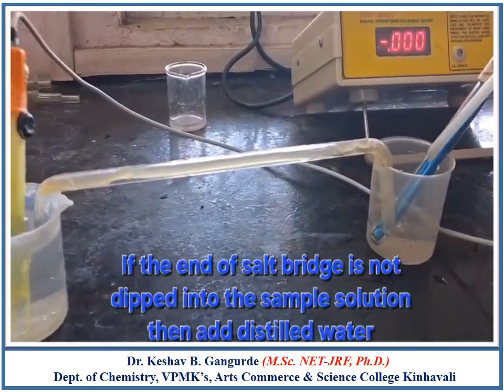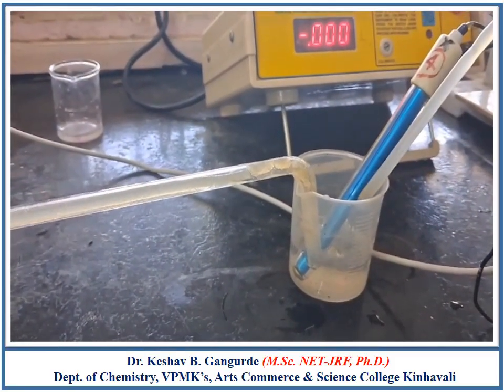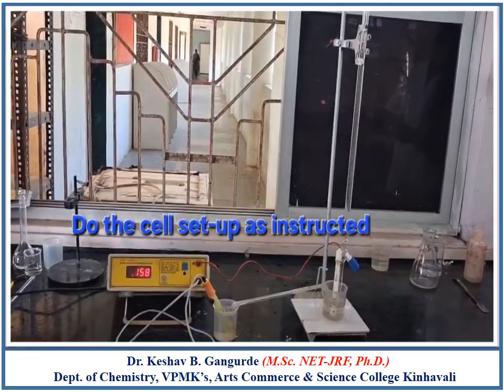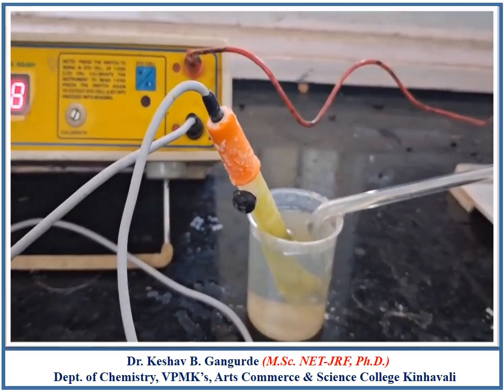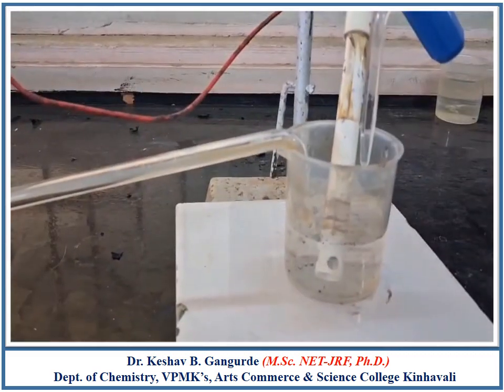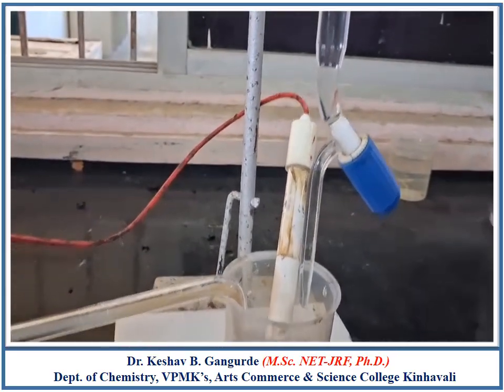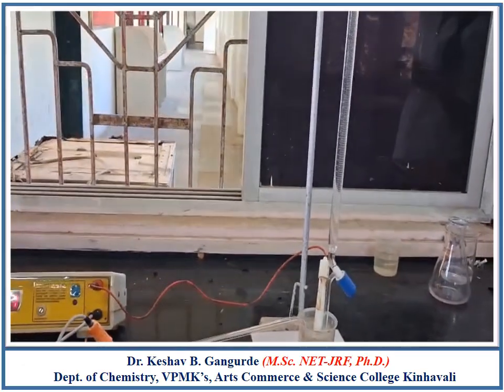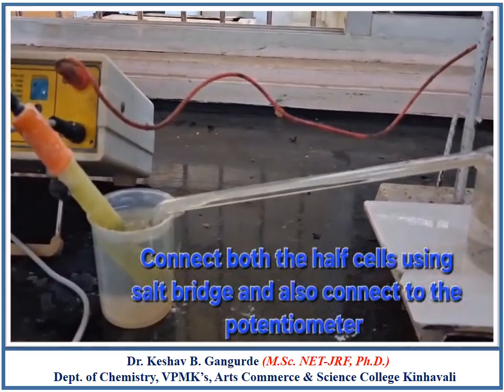If the ends of the salt bridge are not well within the solution, add a sufficient quantity of distilled water to dip the ends of salt bridge. Do the cell setup this way. In one beaker, saturated KCl solution is taken and saturated calomel electrode is inserted in it. In another beaker, diluted vinegar sample solution is taken and platinum electrode is inserted in it. It is so arranged that we can add 0.1 normal NaOH solution from the burette.